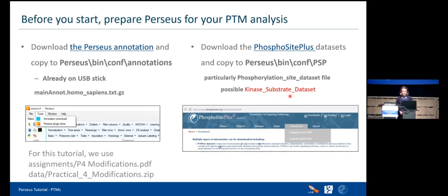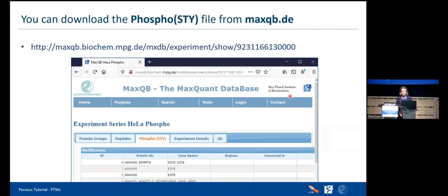Now let's talk about our dataset. You may not have heard about MaxQB — it was like the Max Planck Institute of Biochemistry's proteomics database, used for quite some time for uploading datasets. You can go to MaxQB.biochem.mpg.de and find details about the Sharma et al. phosphoproteomics dataset. You can also navigate to the phospho STY section and dive deeper into the dataset. Participants here don't need this now, but later at home you could check MaxQB.